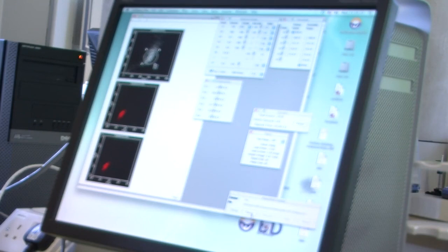Speak about the antibodies themselves, the markers that should be positive, that should be negative, and after that speak about the controls that you use, the techniques that you are using, and there will be different techniques to do characterization, the technique itself, and analyze actually the data. We need to maybe troubleshoot a little bit if something doesn't go as you might think it should have gone. Just troubleshooting and suggest future things that can be done to better characterize the data. Okay, so that's the thing.